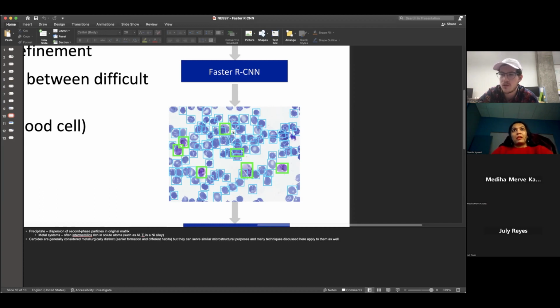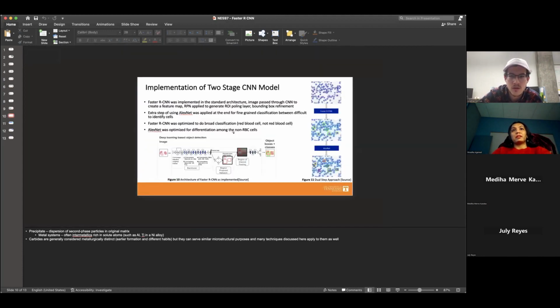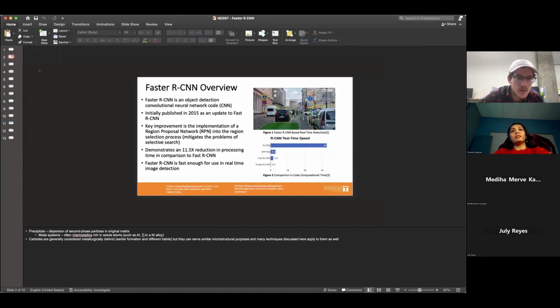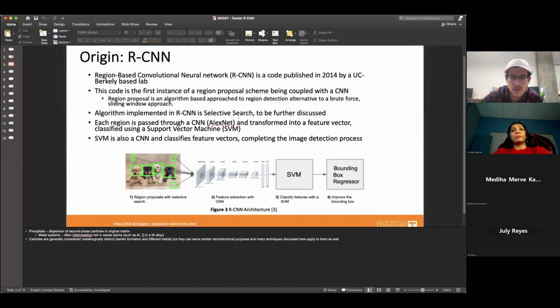Okay. And a similar thing applies to SVM. You said that it's also CNN based. When you were explaining, scrolling up somewhere, the next slide, it's a very good comparison that you have provided between Faster RCNN and the final slide. So in RCNN, we use SVM. Correct. So any idea?